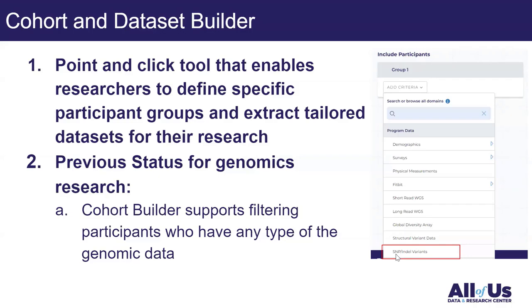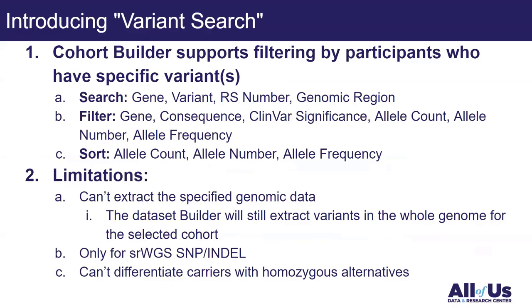The new feature, shown at the bottom, allows you to filter not only by who has any type of genomic data, but also by whether participants have any specific variants. You can filter participants who have specific variants, and you can search by gene, variant, RSID, or genomic region.